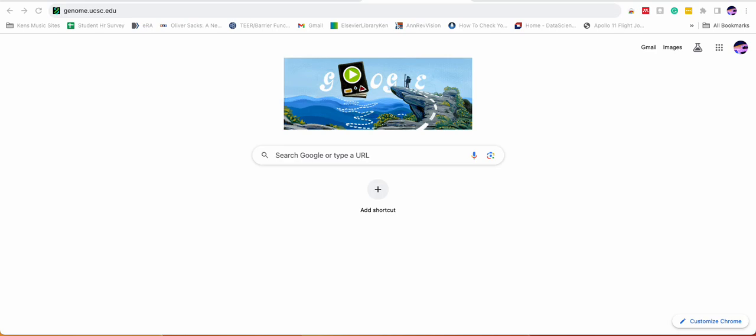Okay, I'm Ken Mitton, and this is basically a screenshot video here that will help you use the University of California, Santa Cruz Genome Browser and how to find genes of interest.